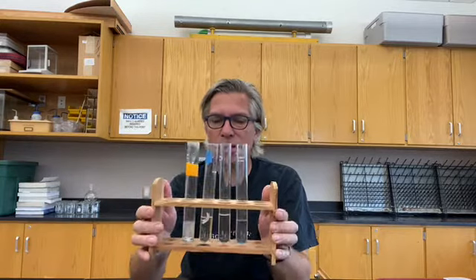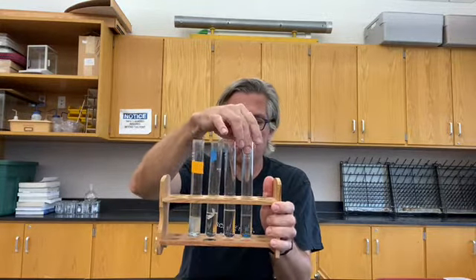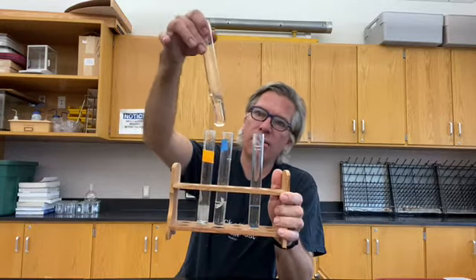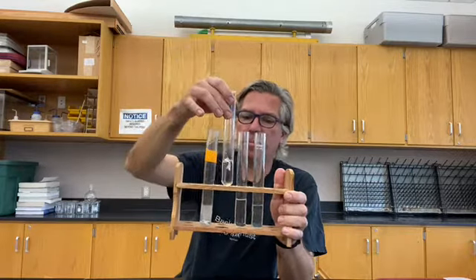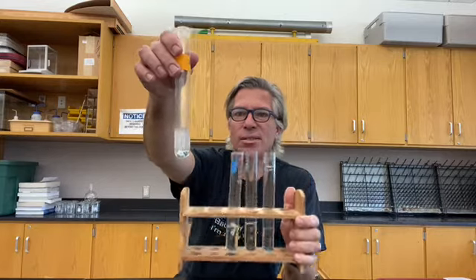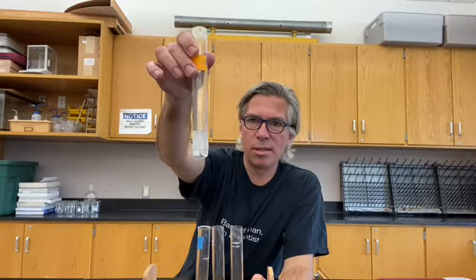So now I've put them all into a solution of hydrochloric acid. Copper sulfate, nothing. Dextrose, well, it's dissolving. Paraffin, nothing. But down here, look, zinc is actually doing something. It's reacting with the hydrochloric acid. You can see those bubbles that are forming there.